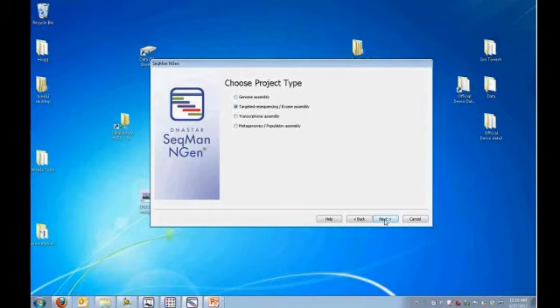Targeted resequencing means that we have a reference sequence, so I just have 2 options. And I'm going to pick the standard output, which is the BAM output. And the BAM output has some really nice advantages.